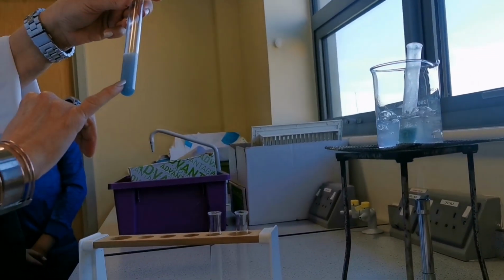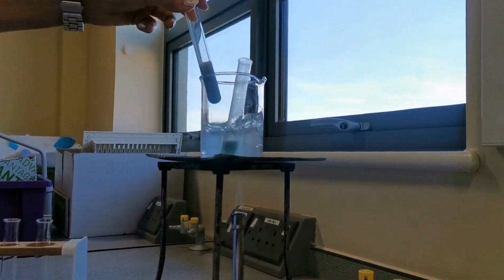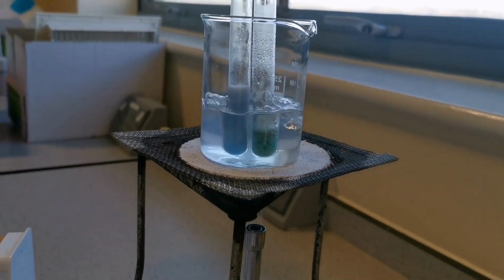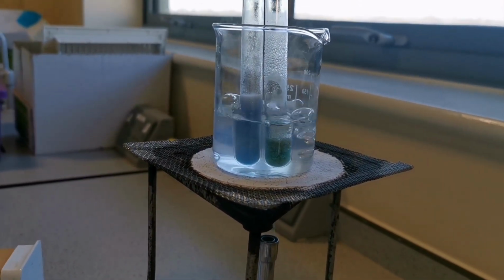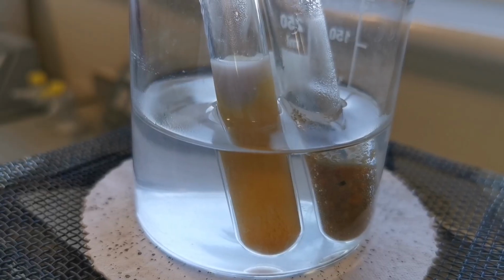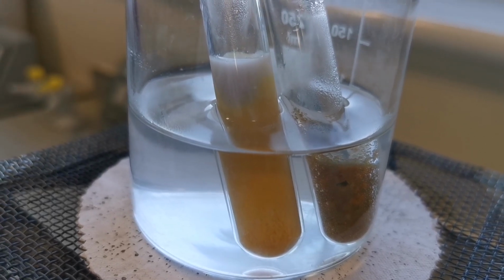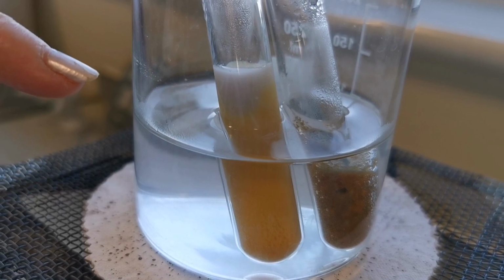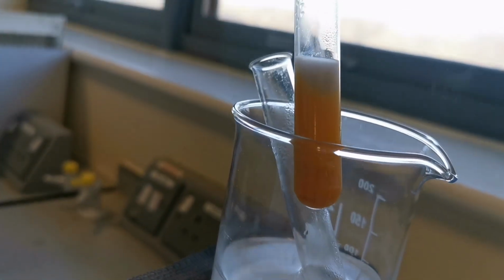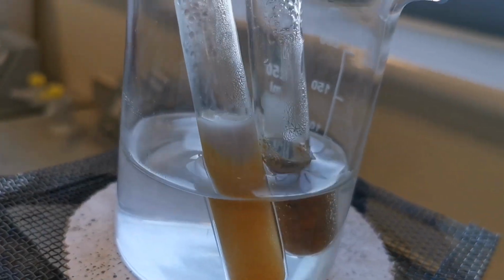We've now added our Benedict's to our milk, so obviously the 2 colours have mixed. This is now blue in colour. Remember, we are looking for a positive result here to turn this orange or red if it is high in sugars. Right, guys, I just want to point out how important it is to have this in a water bath, because you can actually see in the milk how the top bit hasn't been heated, and we just haven't had that colour change that we need. So it's so important when you're doing Benedict's test to remember that you have to heat it as well.